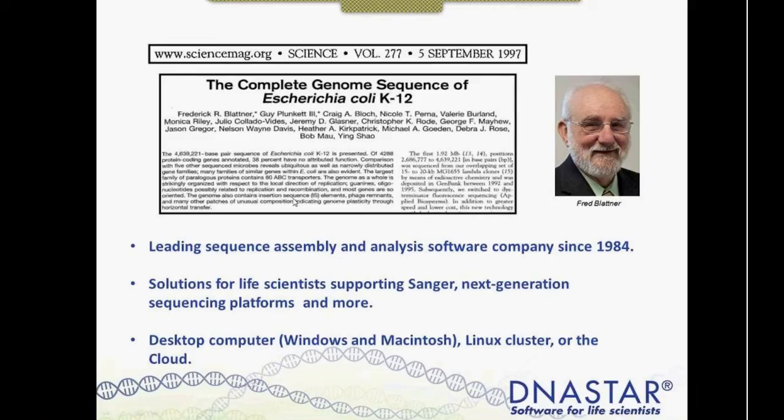And so SeqMan Pro has a lot of different options. For those of you that have worked with SeqMan Pro and looked at some of the menu options, there's many different things, many different ways to edit sequences, different ways to assemble sequences, and it can be a little bit overwhelming. And so the hope is today we'll be able to go through, and I'll try to outline the functionalities of SeqMan Pro, and we can kind of go through some different workflows.